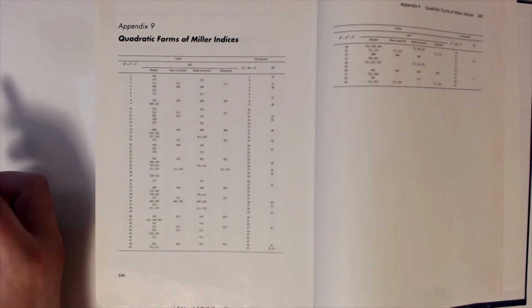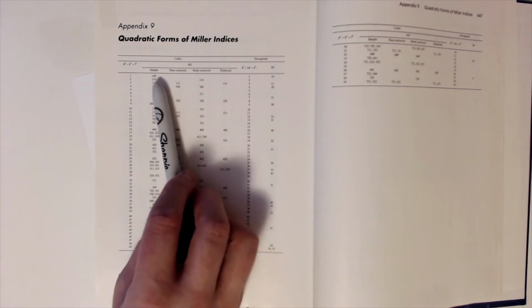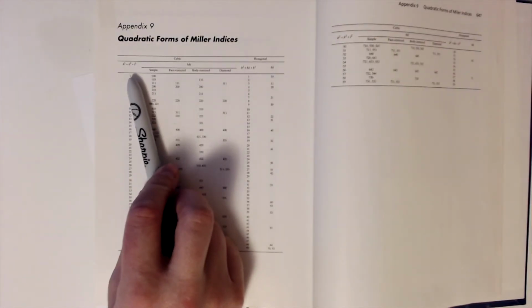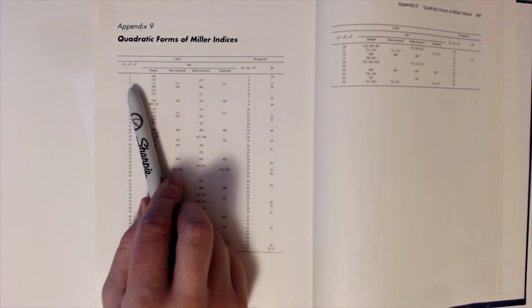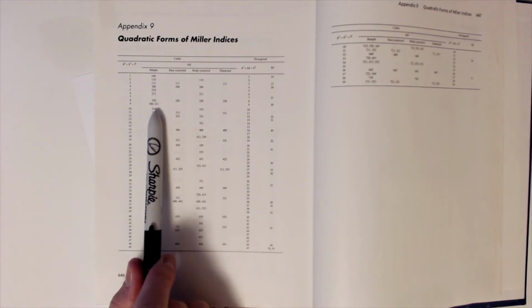Okay, let's see if we can find the S values for the different structures. When I talk about the S values, it's again the sum of squares, h squared plus k squared plus l squared. For simple cubic, since there is the 100 type peak, our first allowable S value is 1. So if it's simple cubic, then peak 1 would have an S value of 1. Since there's a 110, there would be a 2, and 3, and 4, and 5, all the way up to 6. So the allowable S values for simple cubic are simply 1 through 6.